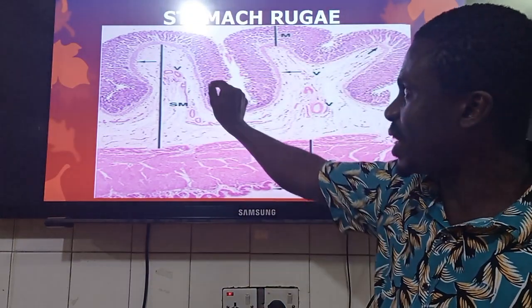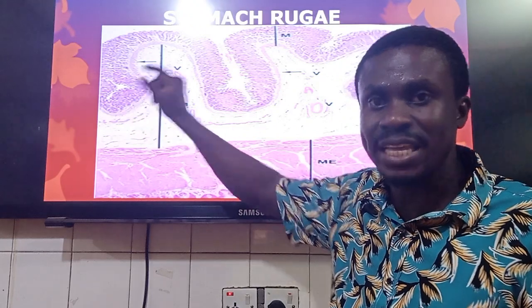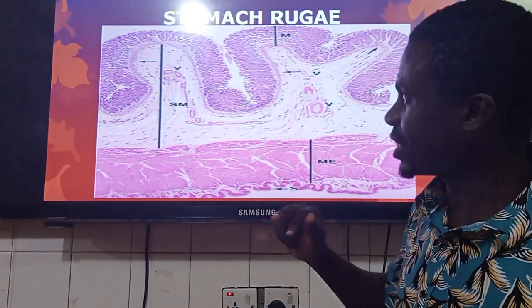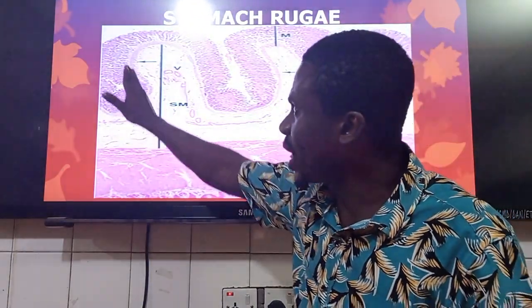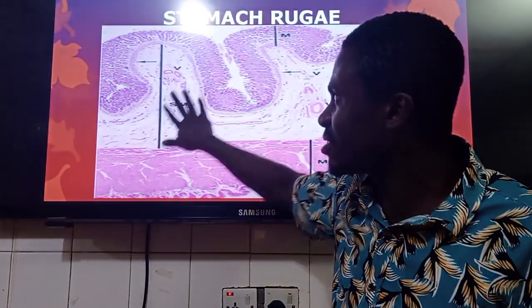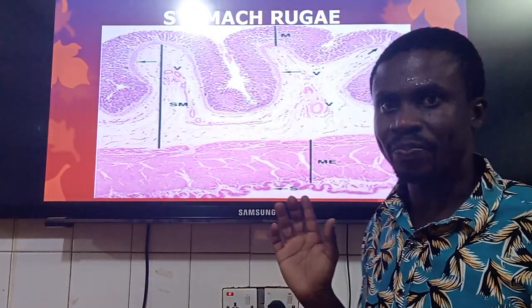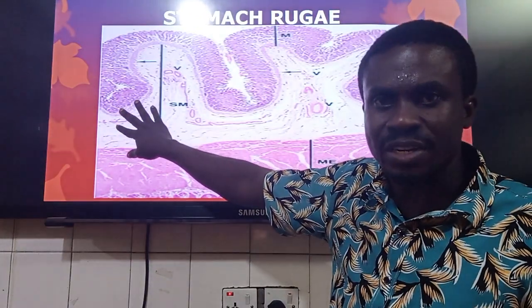Now, this one we've not magnified enough, but there are actually two layers that we find over here. But if you really magnify it, you see the fibers moving, okay, separated. And then, of course, the lamina propria, together with the epithelial lining, moving upwards. And then the core of this fold is mainly the submucosa over here. Remember that the submucosa will be devoid of glands.